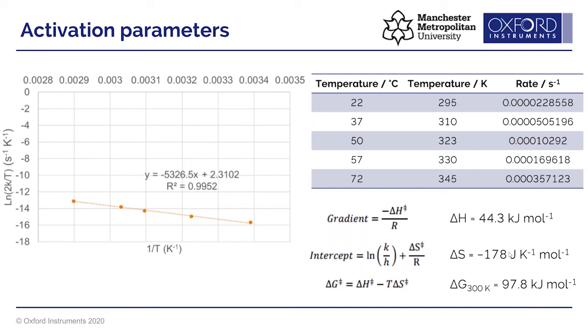Something I could do in the future is the reverse of the esterification reaction, whereby I take the ethyl acetate that I've produced, hydrolyze it, and break it apart into its respective components of acetic acid and ethanol, and then get a different set of thermodynamic values. Once I've got both sets of values, I can calculate the values for the actual reaction.